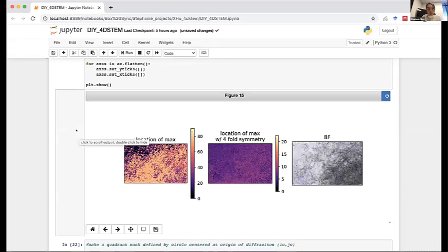So we have one more advanced analysis method. See if there's any more questions, Roberto. Yeah, just I have one here that for this symmetry analysis, right?